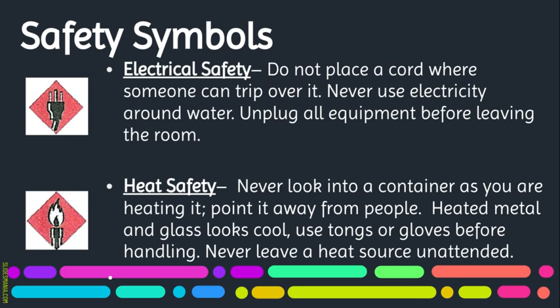Electrical safety. Most of us already know this because this is a commonplace rule for home and school and labs. Don't place a cord where somebody can trip over it, and never use electricity around water. Always unplug all the equipment before leaving the room. If you take a look at my room, I do have lots of electrical outlets, and some just happen to be by sinks. That was not a good design. So when we do use those electrical outlets, I will often tape off the sinks so that you know not to use those sinks when we have electricity.